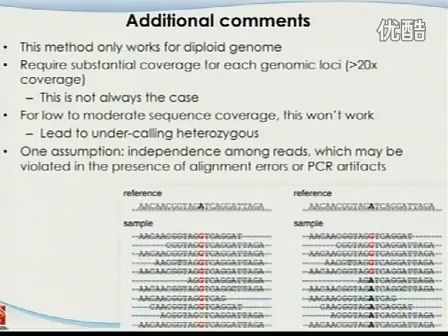Does that make sense? So what I talk about is that we observe so many reads, assuming this is a diploid genome, which has one chromosome from mom and one chromosome from dad. In other words, for any genomic location, there are only supposed to be 2 letters there, right? If it has 3 letters, there's something wrong with our analysis, most likely, right?